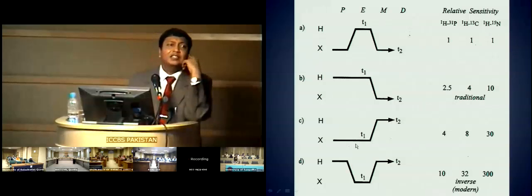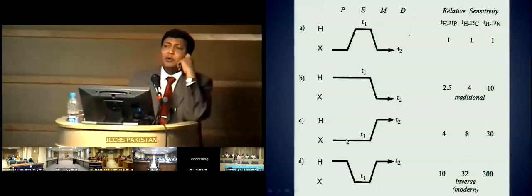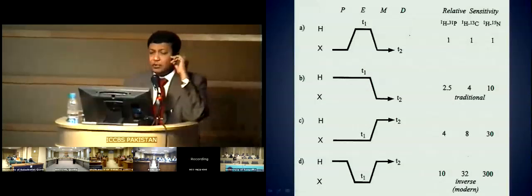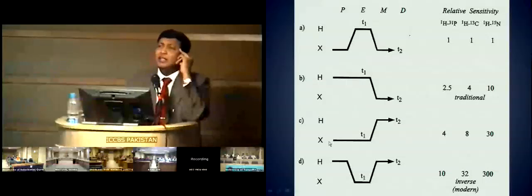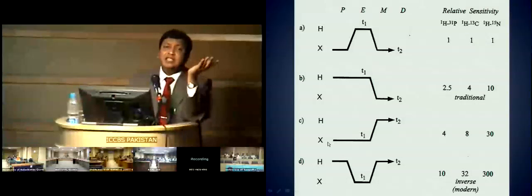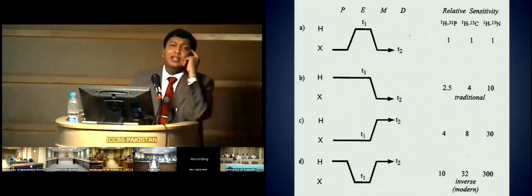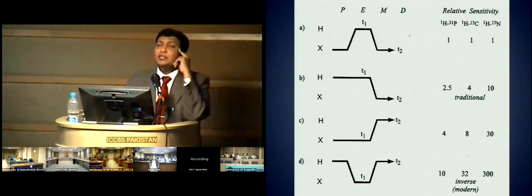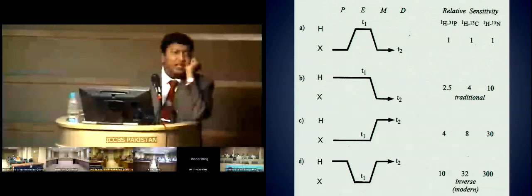You are doing exactly the same thing, that you start with the carbon, you do nothing with the proton, bring carbon to the XY plane, the carbon signal, it is a CH signal, is split into two parts because of a coupling, and then these two parts go to antiphase on X and minus X, right?